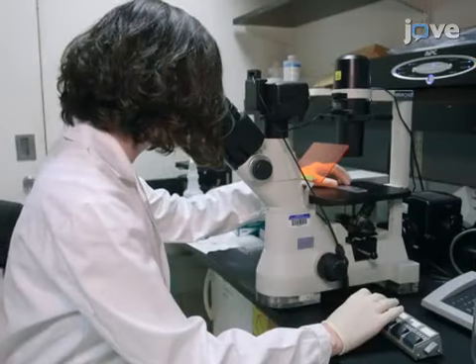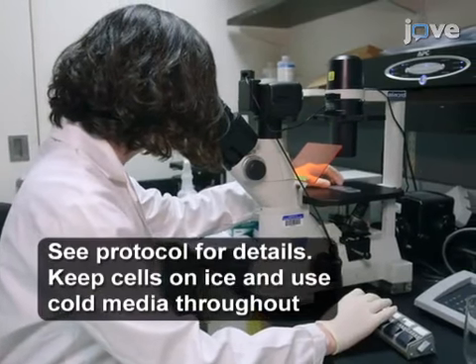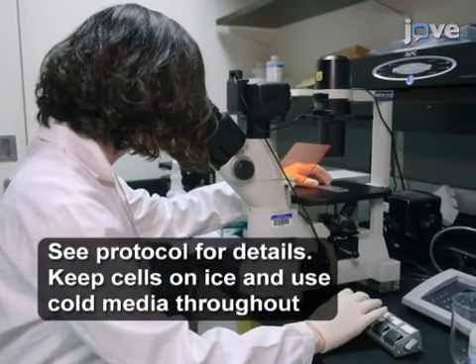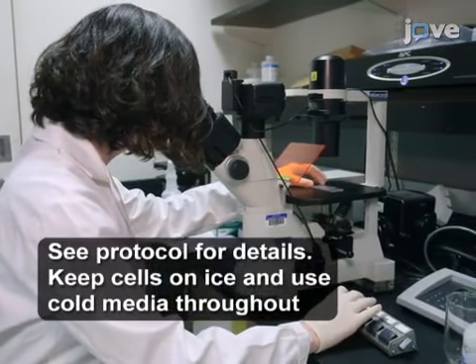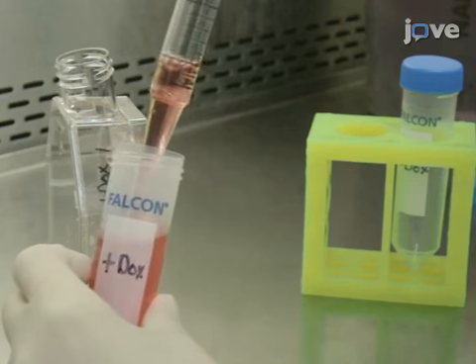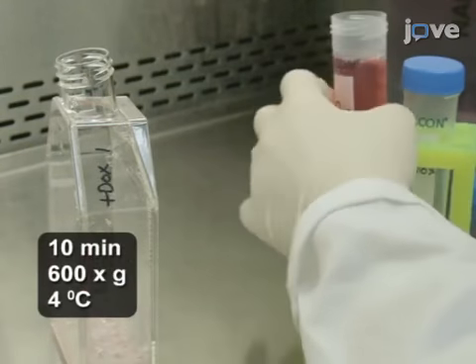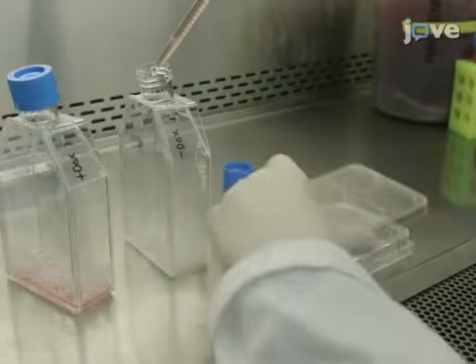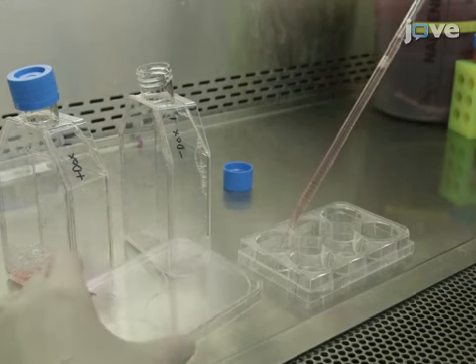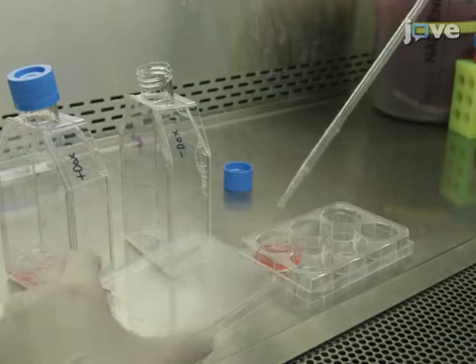To begin, Lister 427 strain bloodstream trypanosomes should be grown to a density of 0.5 to 1 million per milliliter. Aliquot a 50 × 10^6 cells sample into a 50 milliliter tube, and then centrifuge. Save 1 × 10^6 cells in culture to be used later as positive and negative antibody controls.